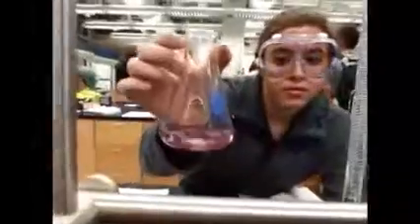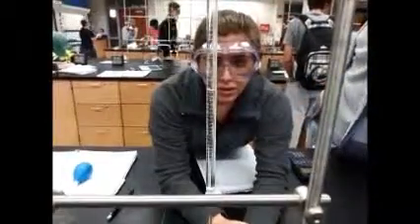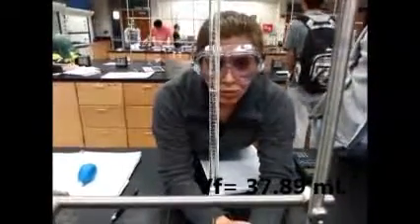Here, Michaela is recording her initial volume. The initial volume is 21.61. Here we see Michaela performing her titration. Here Michaela has achieved a persistent light pink, so her titration is finished. Her final volume is 37.89 milliliters.